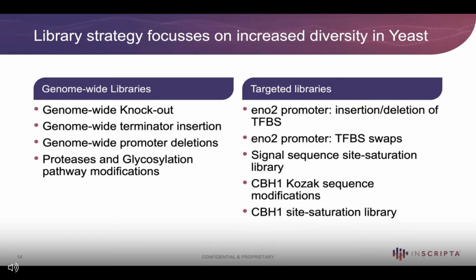And then, so this is the genome-wide, and then we might think of targeted libraries. And this is a different philosophy. This is targeting the actual heterologous sequence that you've inserted into the genome. As soon as it's in the genome and can be carried around in the genome, that becomes accessible to editing. And so we executed a number of edit libraries that are targeting the gene itself.